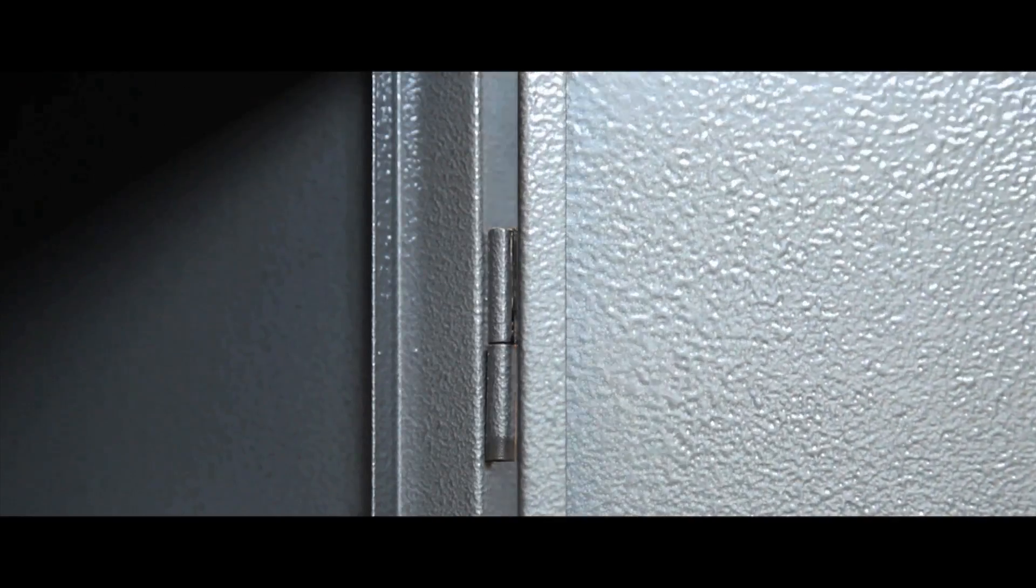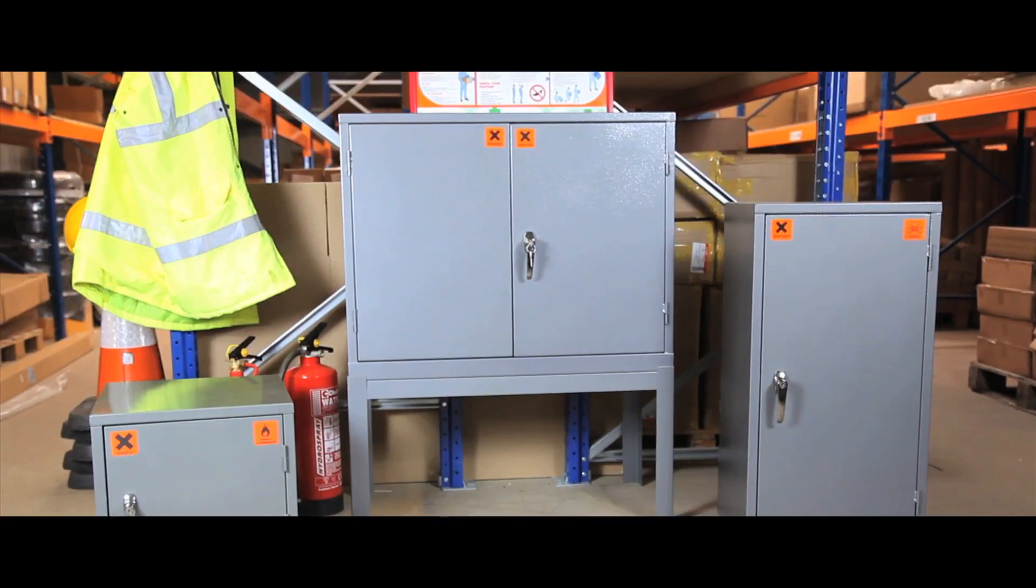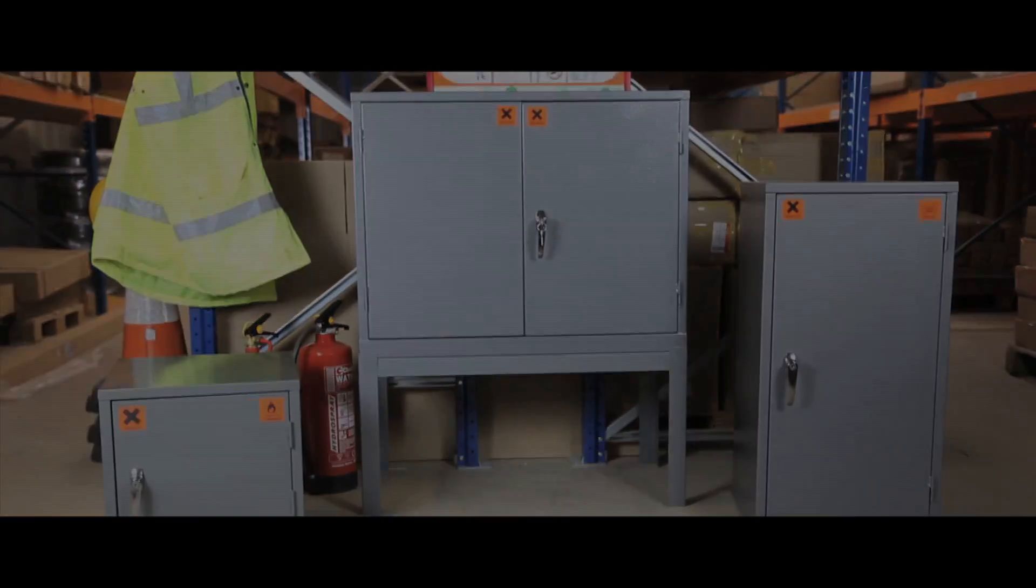Our cabinets comply with all legislation and factory inspectorate approval and is the only design that comes fully welded.